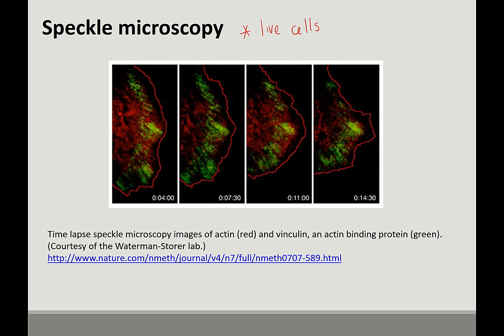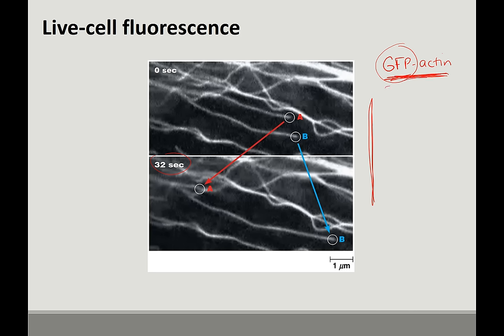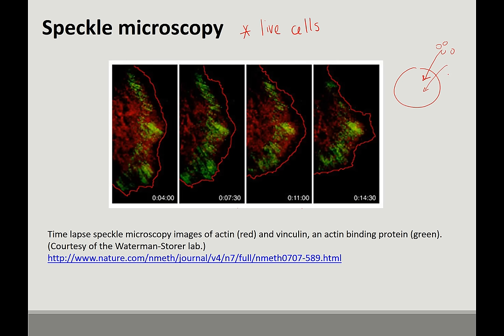What you're doing with this type of microscopy is you're actually injecting. So you've got your cell and you can inject in some labeled proteins. So they were produced somewhere else. So you've got the proteins, you put them in there, and then you watch what happens with them. And this is sometimes an easier way to see things dynamically happening in the cells, because if you start with, like back here, a GFP fusion, everything's going to be labeled, right? Whereas here, you look at the new stuff, how it's being incorporated, how it's moving in the cell instead of the whole cell, everything that's being expressed of that type being labeled. I hope that makes sense.